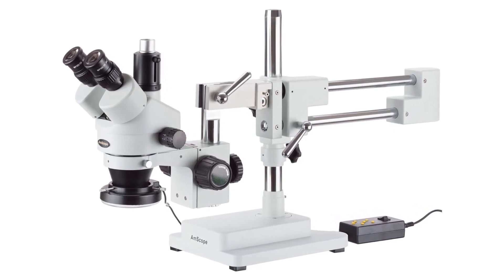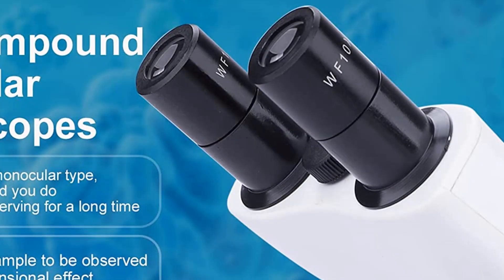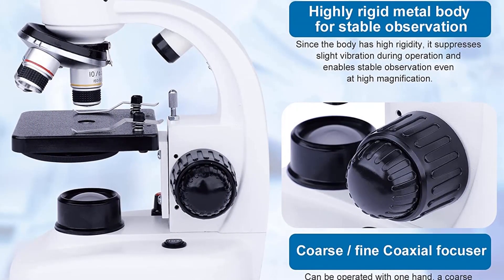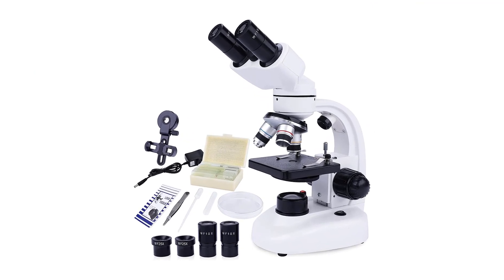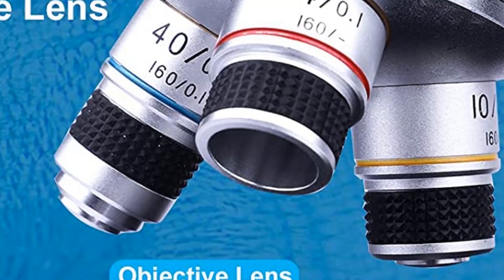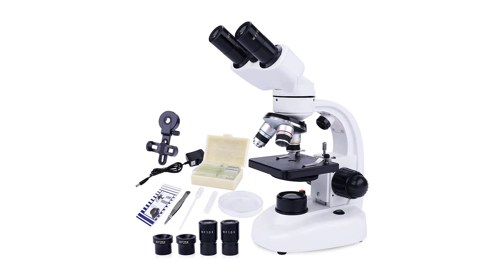Number five, our fifth best pick is the Lacwar 40x to 1000x Binocular Microscope. This compound binocular microscope is an ideal choice for adults interested in home educational or hobby use. It is equipped with a phone holder to capture images and videos of specimens, and comes with a variety of specimen preparation tools. With magnifications up to 1000x, adjustable LED illumination, wide-field eyepieces, and high-resolution image quality, it provides a great user experience.